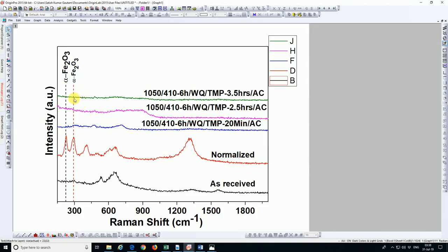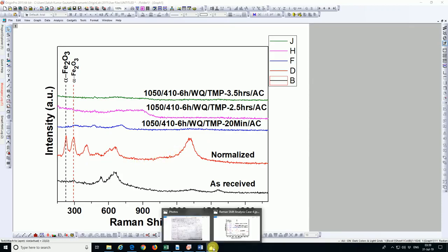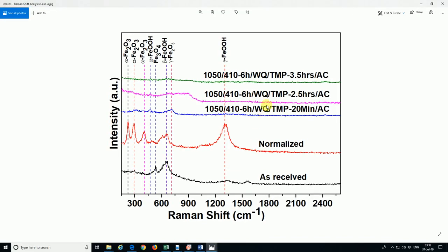So similarly we can put these oxides on the top of these peaks, and we can complete the graph in this way. So this is the complete graph that I have drawn. I have shown you only the 2 peaks. Now you can see here for all the peaks.